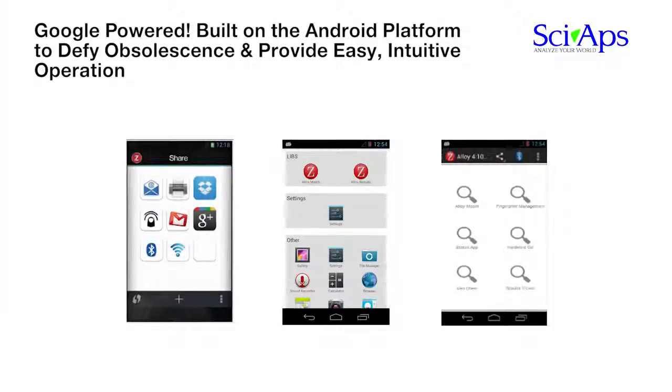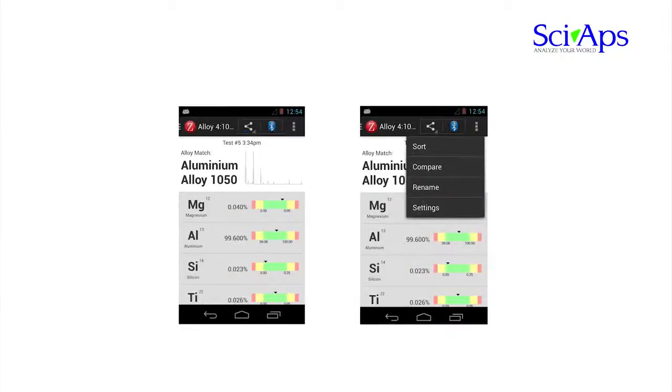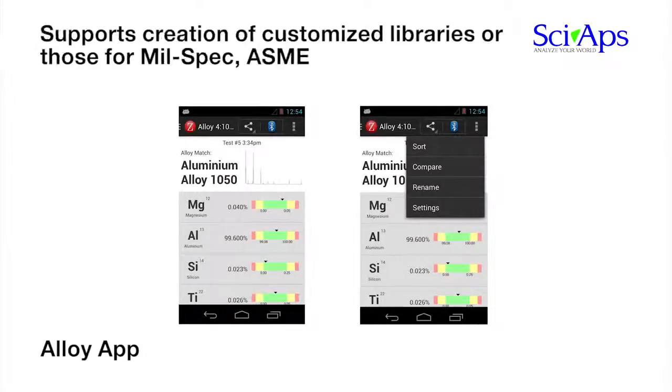The SIAPS-Z is apps-driven like your smartphone or tablet. The analyzer can be purchased with pre-installed apps like Alloy, Geochem, or Academic, or you can download them later. All installed apps are easily visible from the home screen. For the Alloy app, the operator sees the alloy grade ID and can compare the specifications to the actual measured chemistry. The Alloy app provides full editing capability for the grade library and supports creation of customized libraries for mil-spec, ASME, or other conventions.